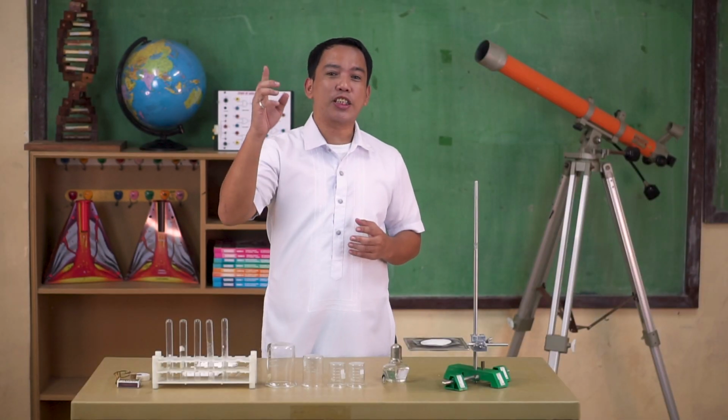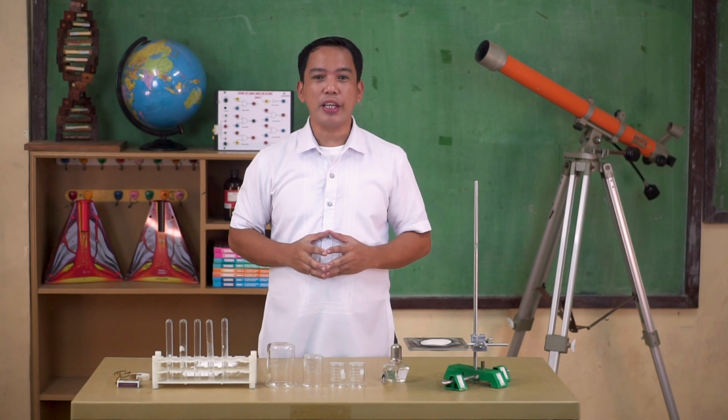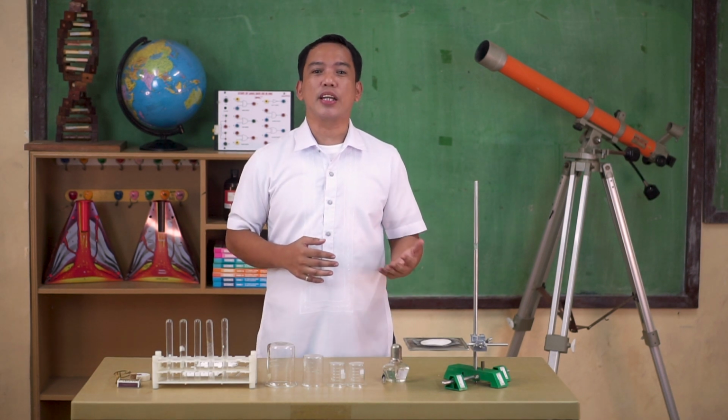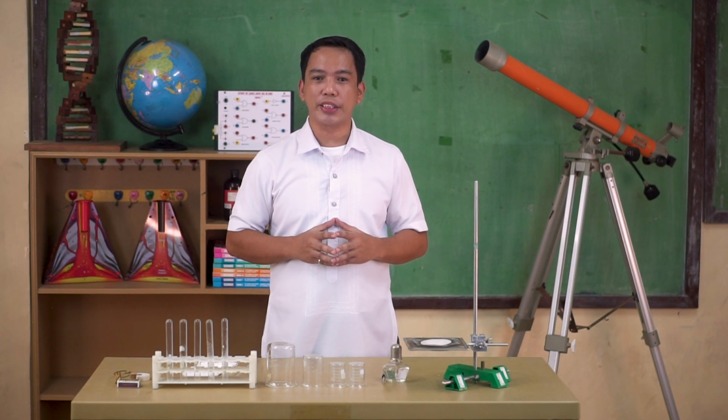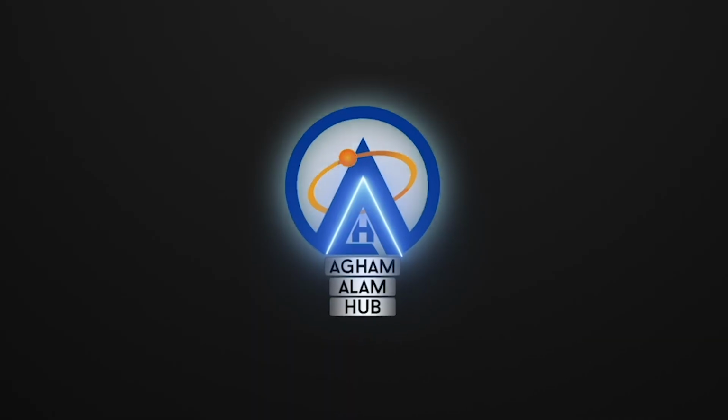The success of an experiment does not depend solely on the use of apparatuses and equipment, but also on the techniques in handling them and understanding the necessary precautions. In this episode of Agham Alam Hub, we discussed the different common laboratory apparatuses and their uses and some important laboratory safety precautions in conducting experiments.